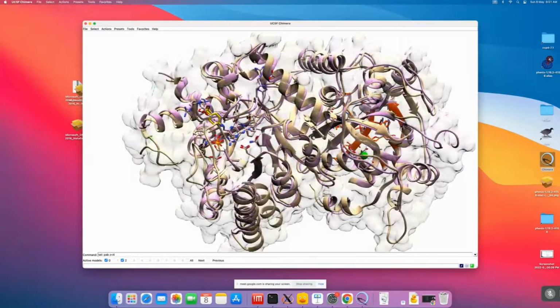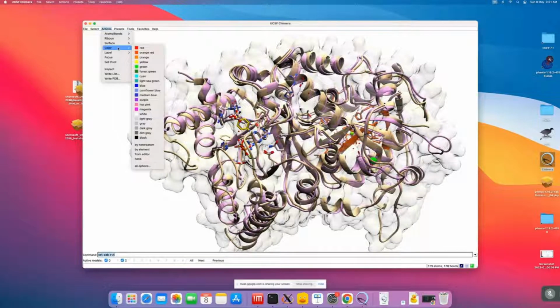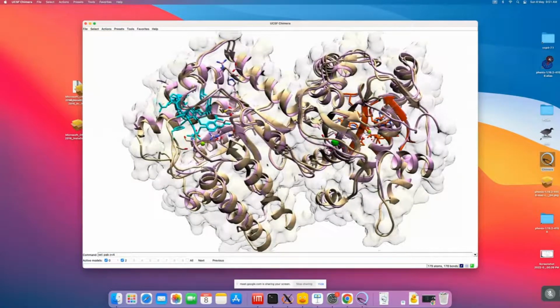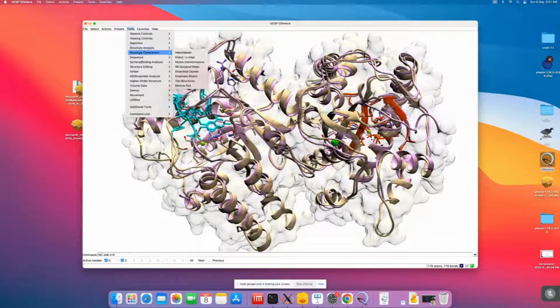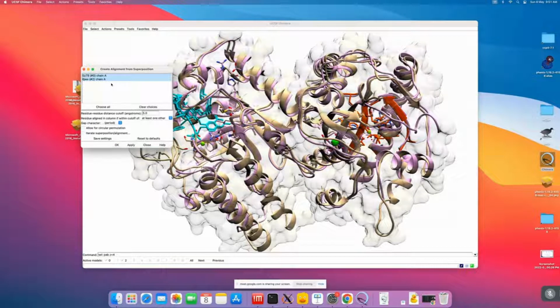So now if you want to see how many residues are bound over here, we can go for the same thing, that is select PABA, Z less than 4, all the residues will be marked, and we can just change the color of that. Right, so this is the basics of structure alignment, and you can also do sequence alignment from the same tool. Structure comparison is the one which will compare all the structures. Matchmaker is the one which will actually overlap all the chains, whatever you are selecting. And match and align is structure-based sequence alignment. So whatever the structure is there, the sequence for the same will be aligned as per the structure and not as per Clustal W. So you just click OK.